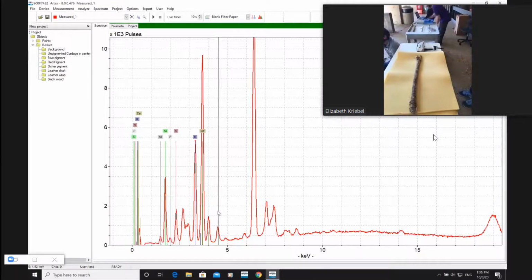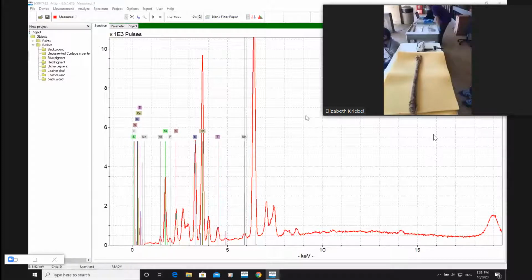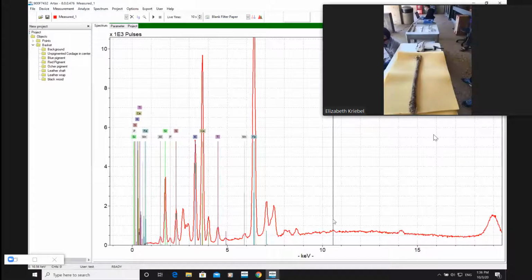Potassium and calcium, because it's made of wood, and that's what we see with wood. A lot of titanium, because we have that silicate mixed in. We've got a little bit of manganese, a ton of iron. So this iron is definitely a pigment in origin. And then I don't see any nasties. Maybe a trace of lead, but it's not very compelling to me. So the big interesting thing here is there's no salt wash, and that there's some pigment.